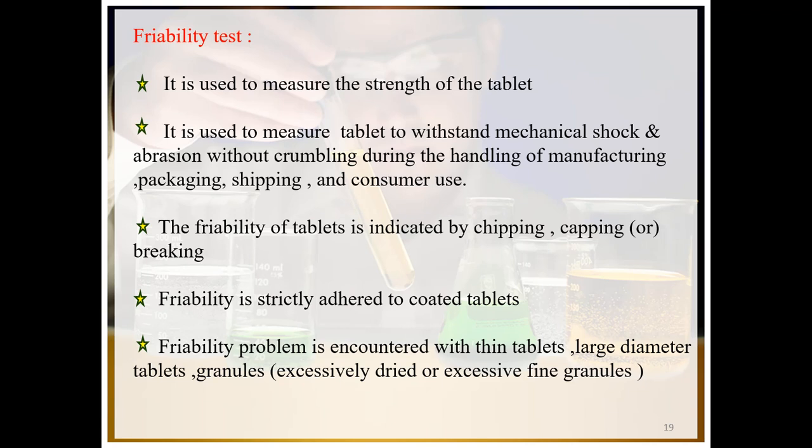The friability test is generally for tablets, indicated by chipping, capping, and breaking. This friability test is strictly adhered to for coated tablets.